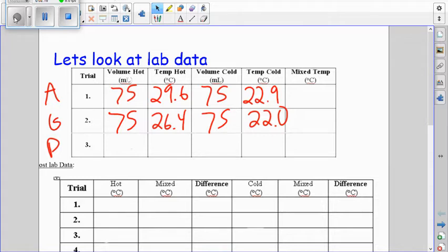And I'm going to mix. Kind of stir that around, make sure they get mixed nice. Okay. Now I'm going to get the temperature of Gabby's mix while we wait for Amanda's mix for a second there. Gabby's mix is coming in at, let's see here, 24.1. And Amanda over here, we're looking at a 26, let's see here, 26.2.